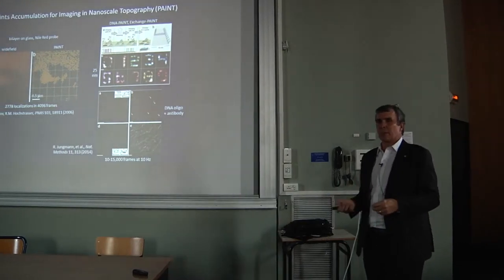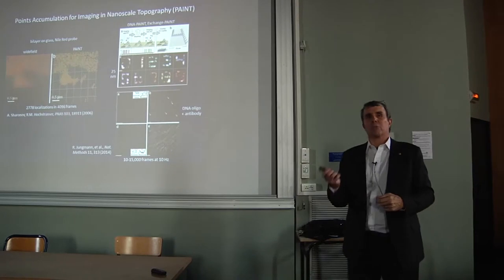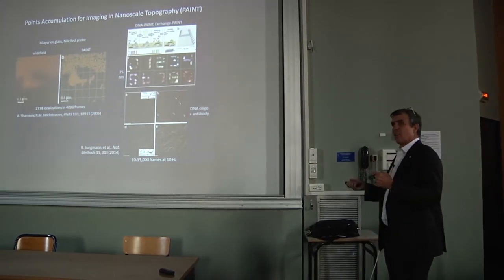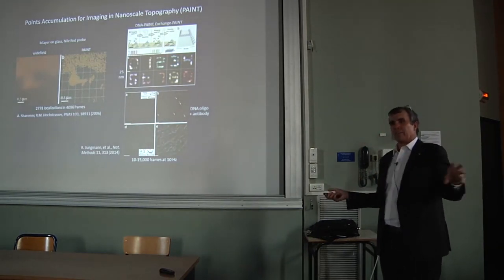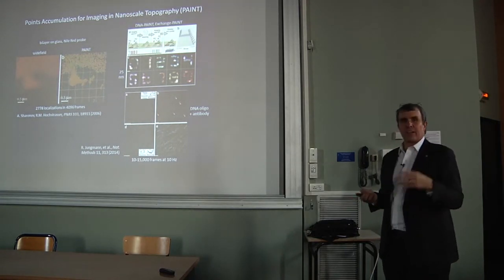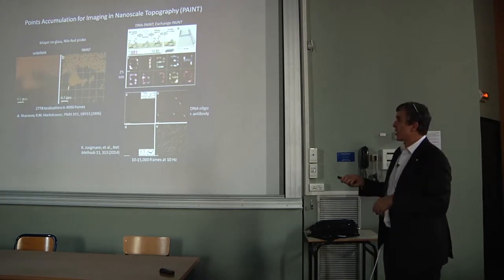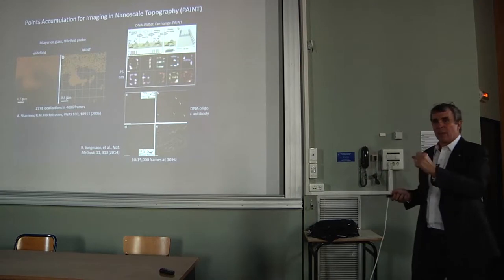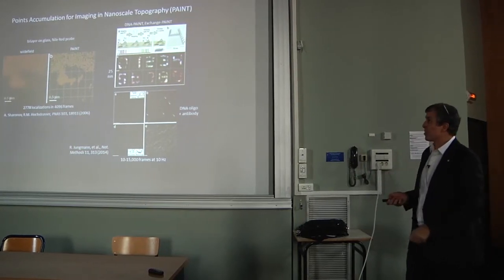But there's another method of super resolution that came out in the same year as our Palm paper, which works differently. This method is called PAINT. The molecules are actually in the cell media, not in the cell itself initially. Normally they're whizzing around so fast under their Brownian motion that you can't see them at the capture rate of the cameras. But when they stick and bind to their targets, then they're fixed and they're a little glowing star, and then you can localize those.